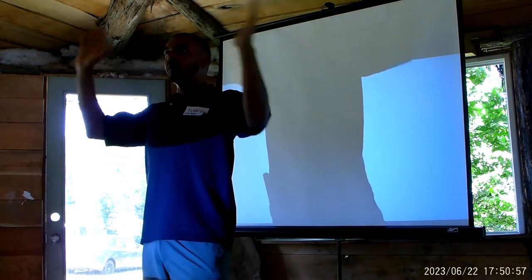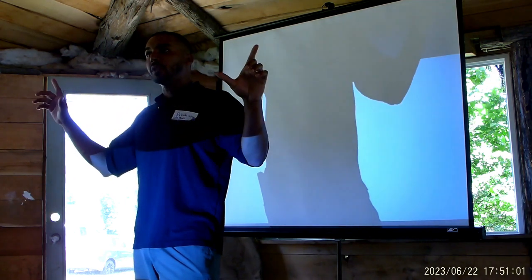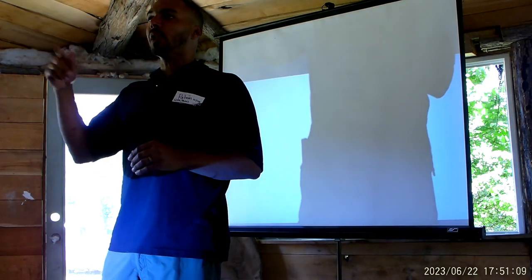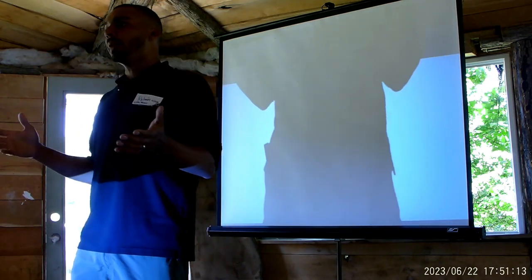So that's a basic overview of the soil food web. We're looking for maximum diversity. As we put samples onto the screen, we'll also talk about the different features of the soil too. It's not just in the microbes, but what the microbes are doing.